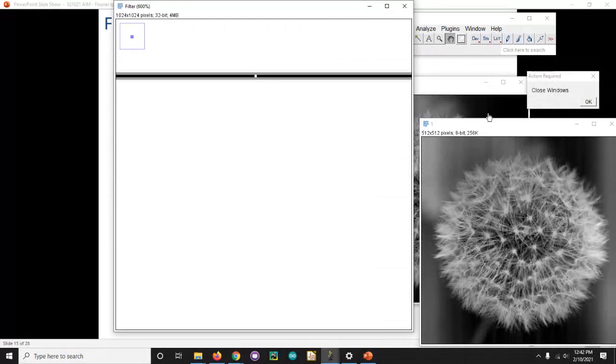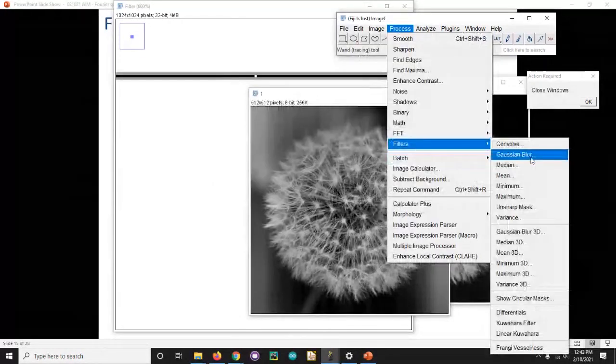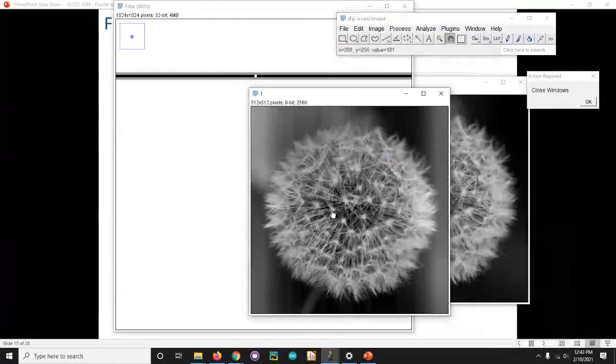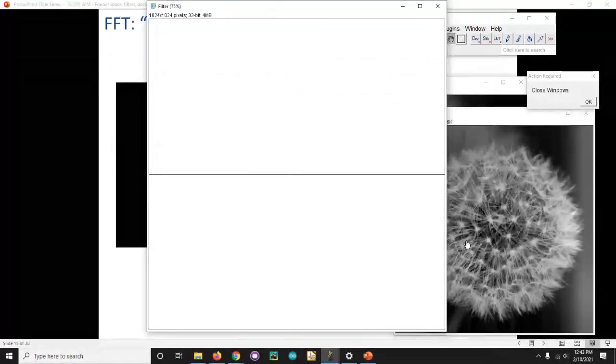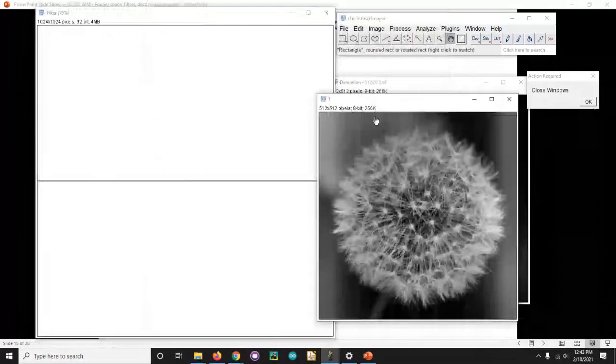Hey, Ben. Yep. Tommy asks, what if the stripes are diagonal? Okay. So the catch is that the bandpass filter only assumes vertical or horizontal, but that doesn't mean that's all you can filter. And actually someone already had a pretty good recommendation, which does work, which is you could actually just grab the filter it generated and then just rotate it to the arbitrary angle that lines up with your diagonal lines.